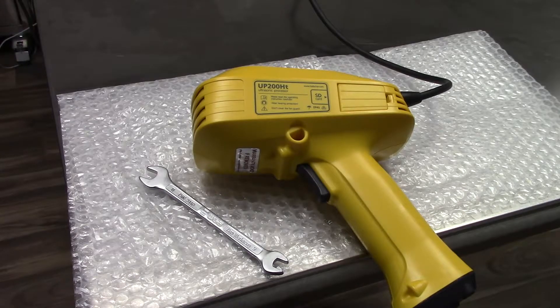In today's video, we'll be dismounting and mounting a sonotrode. Make sure your unit is unplugged from the power source and not powered.